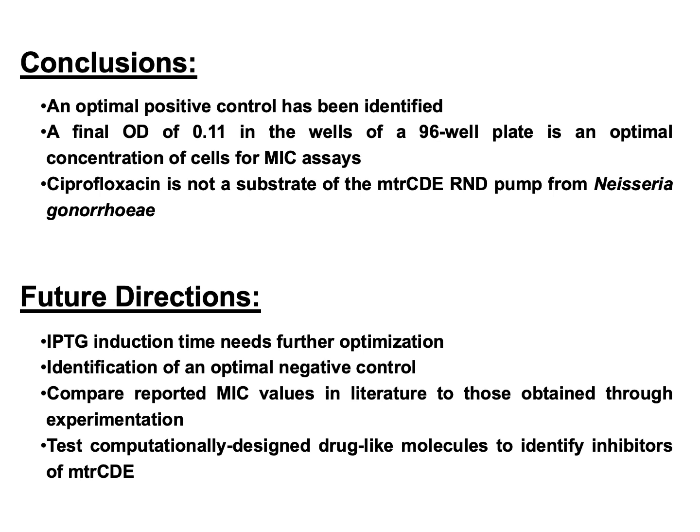To continue this research, the assay should continue to be optimized by identifying the optimal IPTG induction time and negative control. In addition, experimentally obtained MIC values should be compared to literature values. Ultimately, the computationally designed potential inhibitors of mtrCDE should be tested to experimentally identify actual inhibitors.